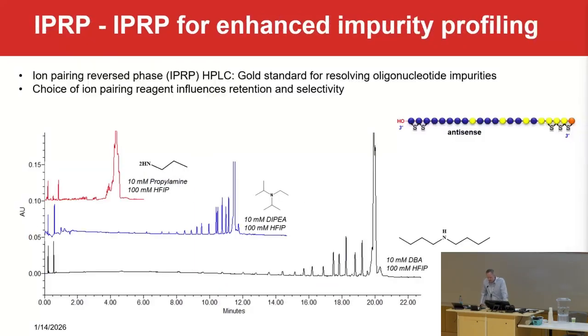The next few slides then are more of a deep dive on purity and impurity analysis for oligonucleotides. So as Jane pointed out, impurities are of great concern, and we have a lot of eyes on what the impurity profile is for our drug substance and drug product molecules.